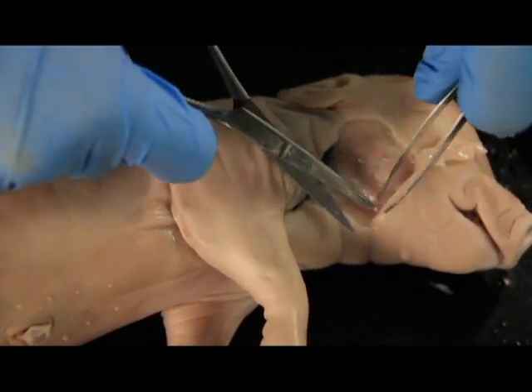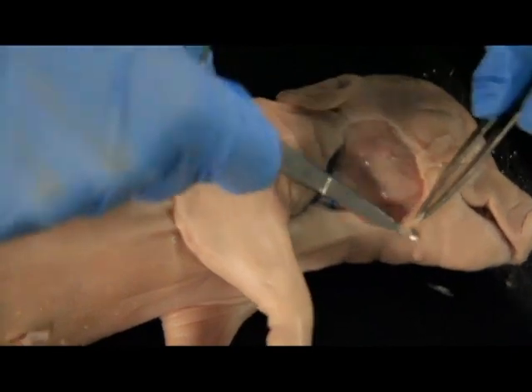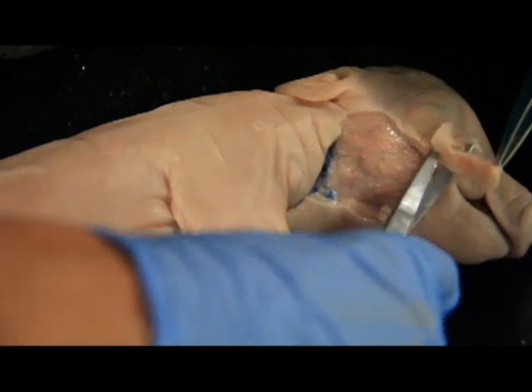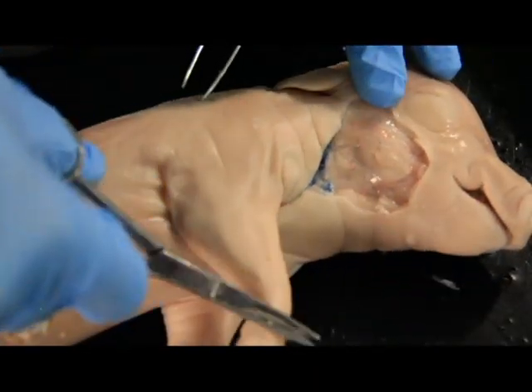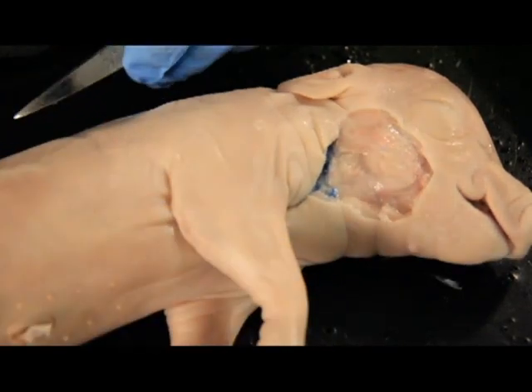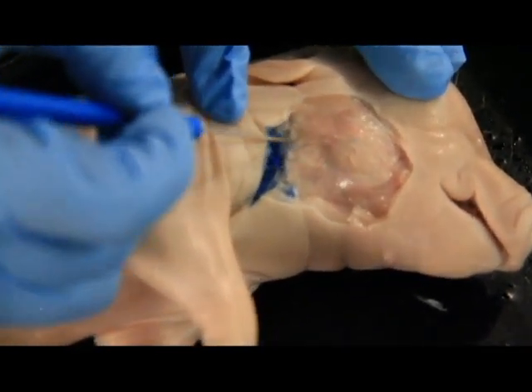So as we remove this, you can see I'm just cutting at the skin. I'm not going too deep, just cutting these connective tissues. And then we're going to remove that, and you can see in nice and clearly right here. Okay, so we've got our big masseter muscle right here. We've got all this parotid gland out here.